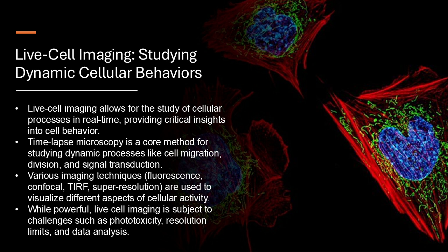Are there any areas where you think live cell imaging will have a particularly big impact in the future? Well, one area I'm particularly excited about is the study of how cells interact with each other in these complex tissues and organs. You see, up until now, a lot of research has focused on individual cells in isolation. But in reality, our bodies are made up of trillions of cells, all working together in this beautifully orchestrated symphony of life. It's just like moving from observing individual instruments to appreciating the full orchestra.